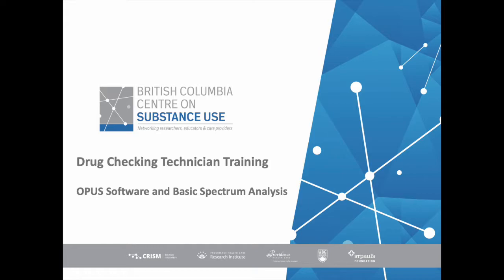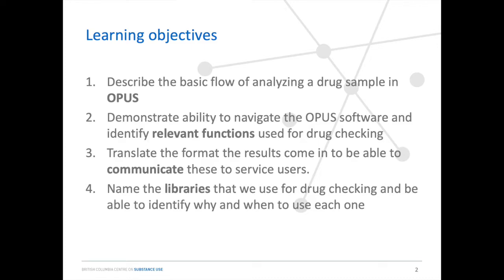In this video, I'm going to introduce the software that is used for drug checking and the basics behind analyzing drug samples on the FTIR. We recommend that if you have not watched the introductory FTIR webinar, that you watch that one first. In this webinar, we're going to introduce you to the fundamental mechanics and flow of a drug check.